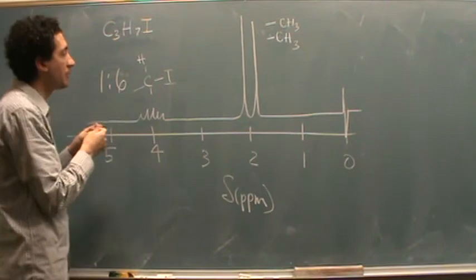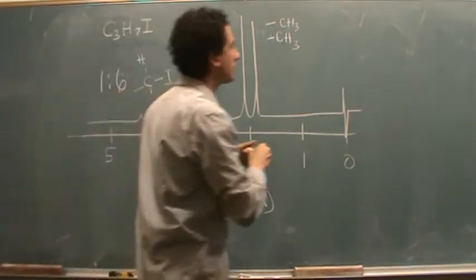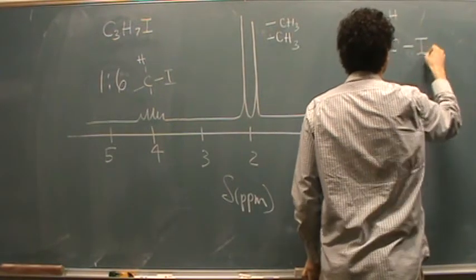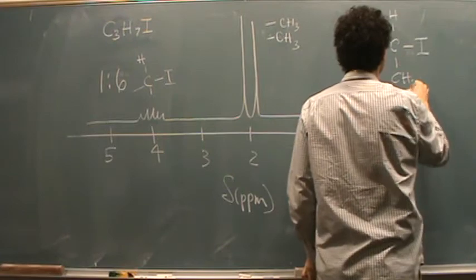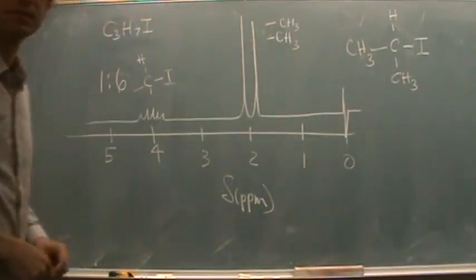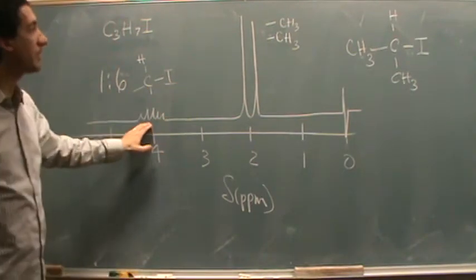And what I expect, just put the pieces together. We've got the 2 methyl groups attached right here. So it's something like this. And now let's double check our answer to see if this works. So we think the single hydrogen is this peak.